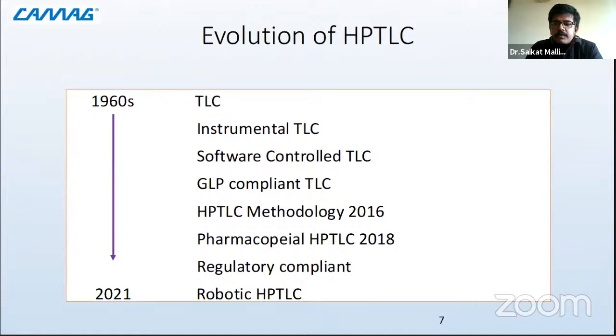And even today, many of the pharma companies just do TLC and they are happy with it. But the trend has already started to change, because now you have an option to do the documentation, control the instrument, and develop quantitative data, apart from other applications which I'll be discussing in this session. It is totally a different format. Previously it was not there, but now it is. And it is also backed up by regulatory compliance, because I cannot just say the technique is okay and you can use it. As long as you have a methodology defined by any of the pharmacopoeias, that yes, you have to do it in this way, the standardization helps in giving reproducible results from lab to lab and minimizes variation.